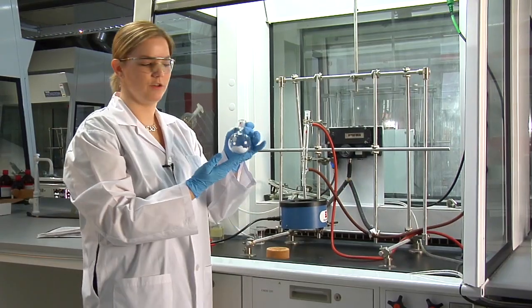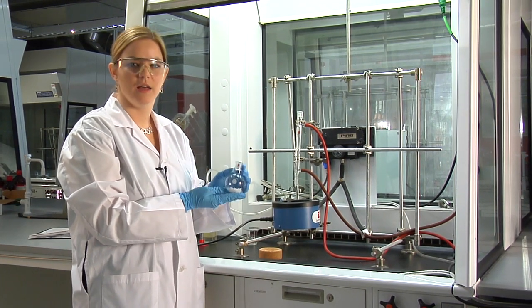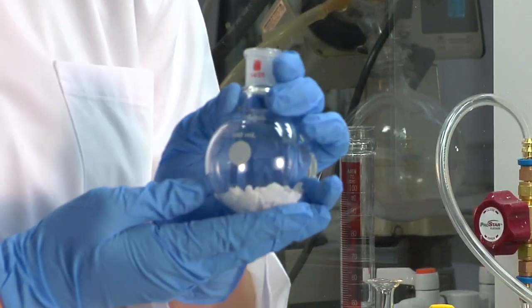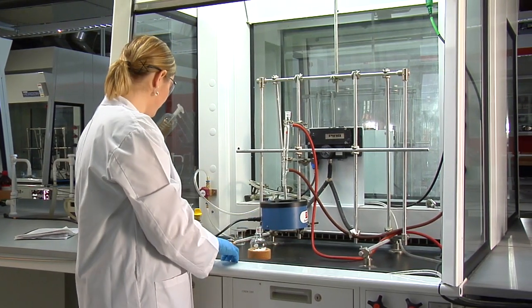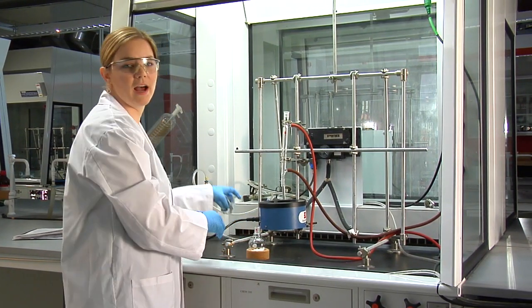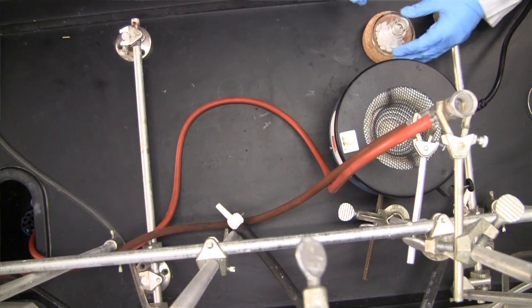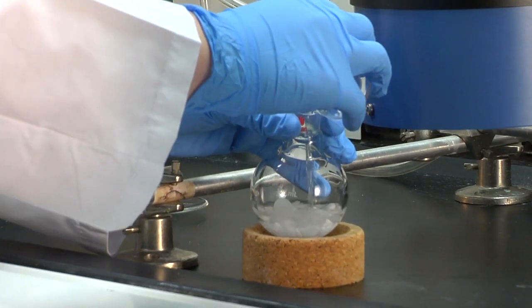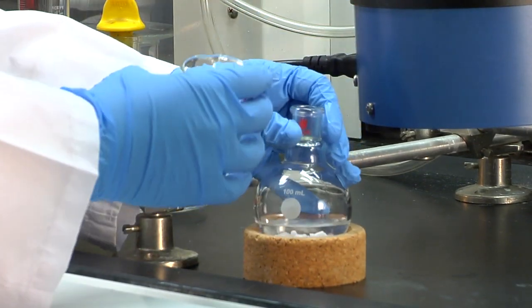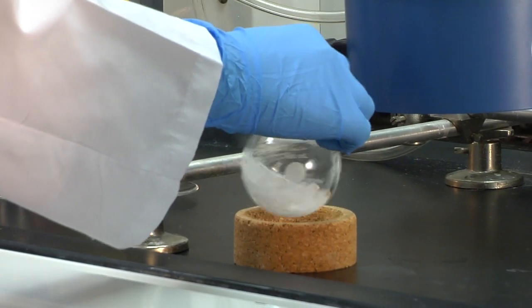You're going to be taking your 100 ml round bottom flask and measuring out the 10 grams of benzoic acid from the side at the balance. And you're going to bring it back to your bench. And we're going to add 25 mils of methanol. Okay. So we're going to be dissolving that in the methanol.